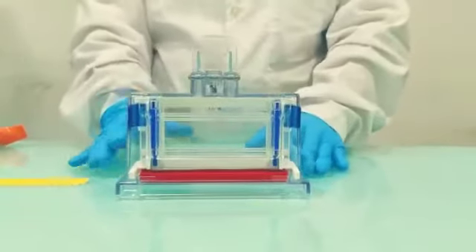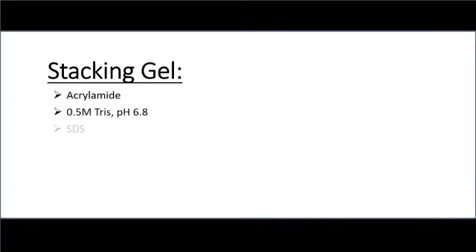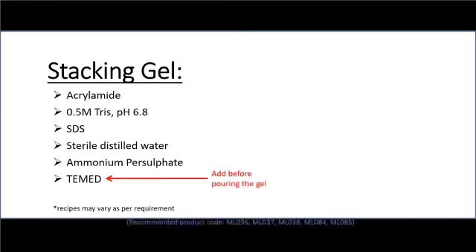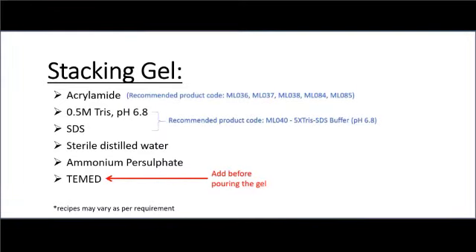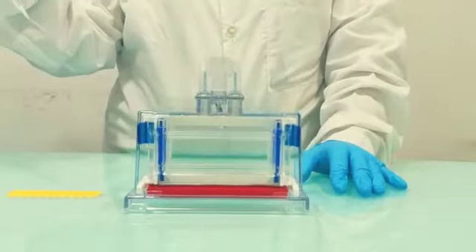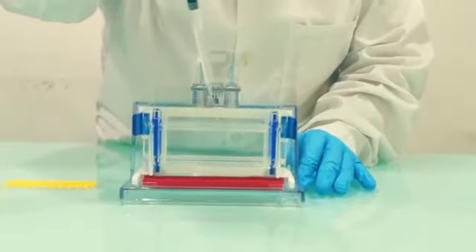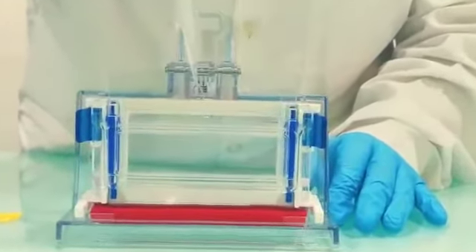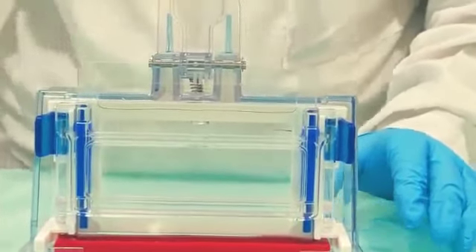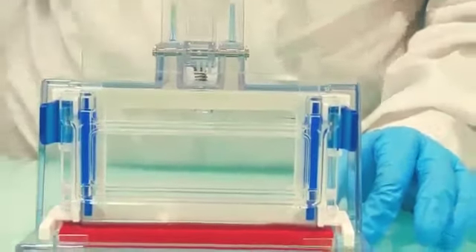Next, we will cast the stacking gel. The recipe includes these ingredients. Make sure again you add TEMED in the end. Fill the rest of the plate with stacking gel up to the top. Make sure no air bubbles are formed, as they will get trapped.